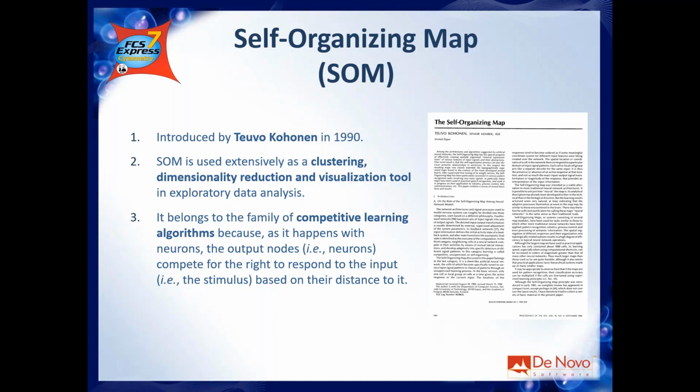SOM is a technique that was developed like 30 years ago, actually September 1990, by Professor Kohonen, and it's considered a clustering and a dimensionality reduction. So you will see why this is, okay? It's not only a clustering, it's also dimensionality reduction and a visualization tool.